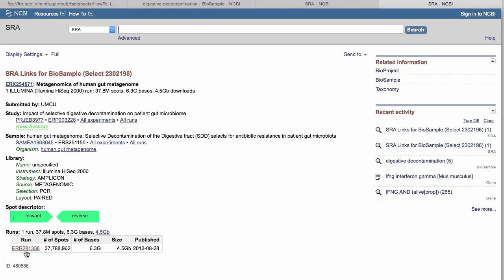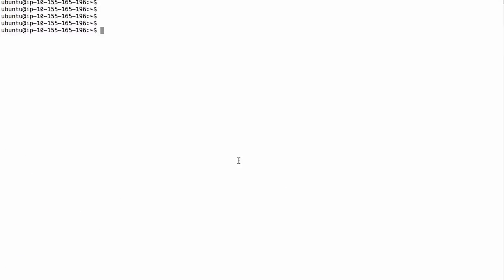We're going to work on standalone BLAST right now. To do this, I've started an instance at Amazon Web Services (AWS) and installed the Linux SRA toolkit binaries there. I'd also like to mention that we do have SRA binaries for PCs and Macs, so you could try searches on your desktop. The fact sheet I mentioned earlier could help with this.